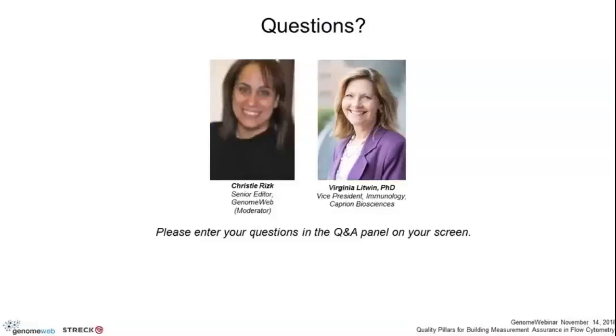They need to be fully validated, and I think they're great. They save time and give us more consistent data. But we need to also understand them. So I'm always a little hesitant to put something in my validation that I don't understand pretty well. We can't have a black box kind of thing.